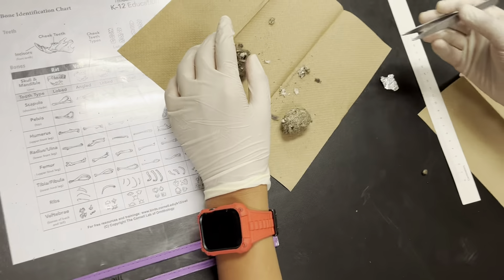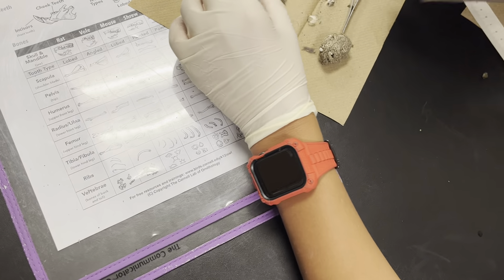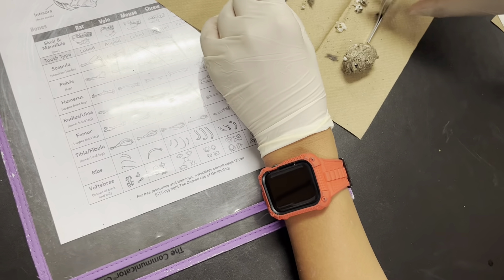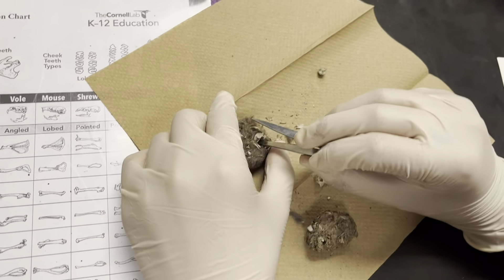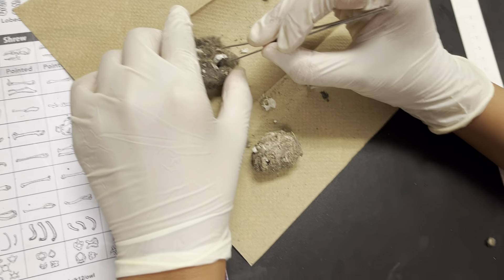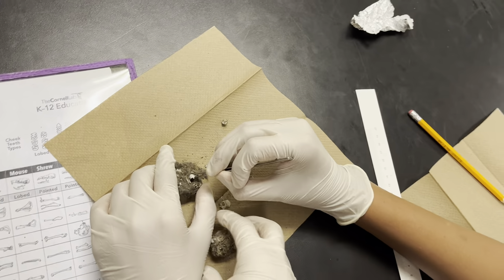I'm so confused — it broke. Yeah, tear it apart. You're using your chart. Is this supposed to break? The bones are very fragile. I thought the bones were hard — I didn't know they were fragile. I can't get this one out.